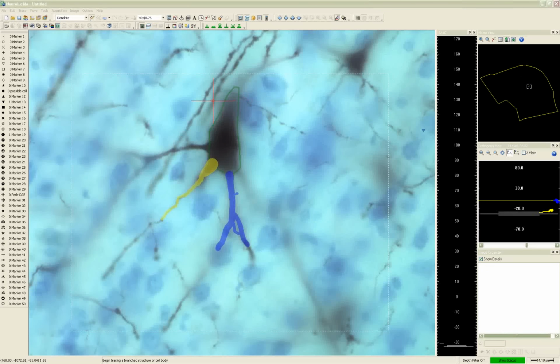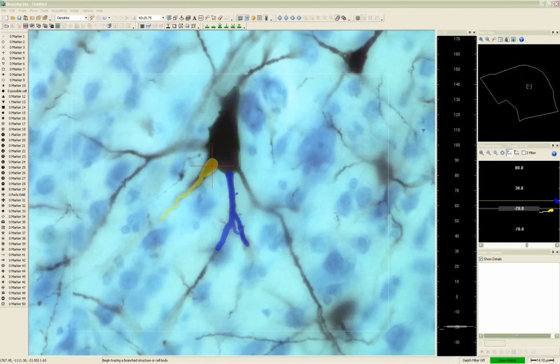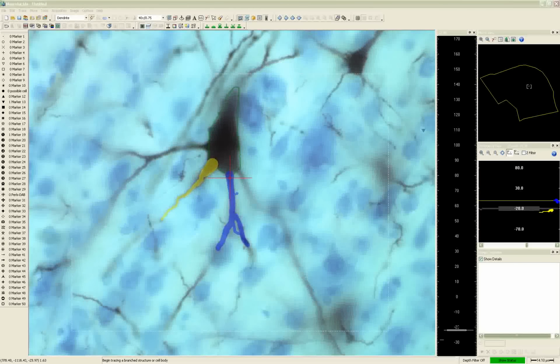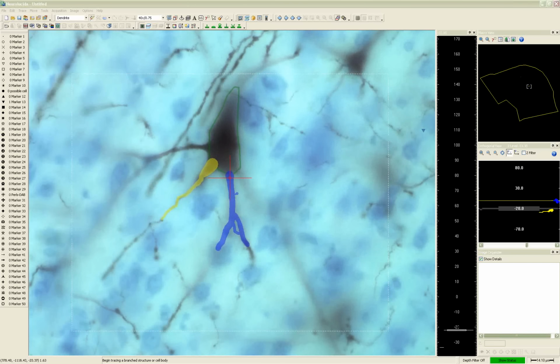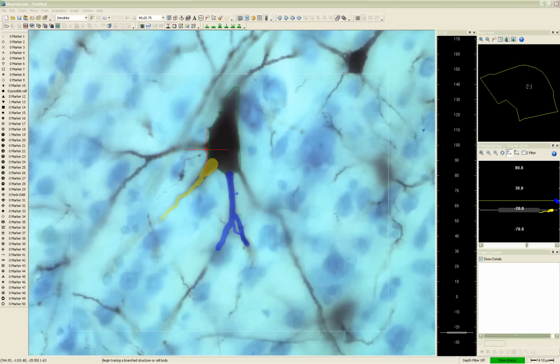Okay, so there's been a couple of questions about how to distinguish the axon versus dendrites, and I leave that to you. You guys are the experts in your systems, so I don't have any magic tricks for you. It's an anatomical thing, and it'll vary depending on your cell type and what you see and how it's visualized. So I don't have any pat answers for you, unfortunately.